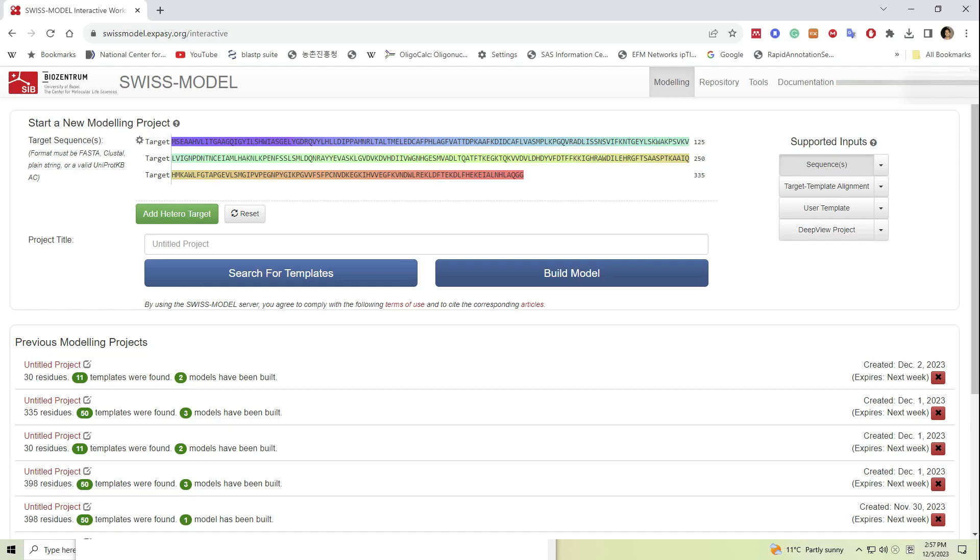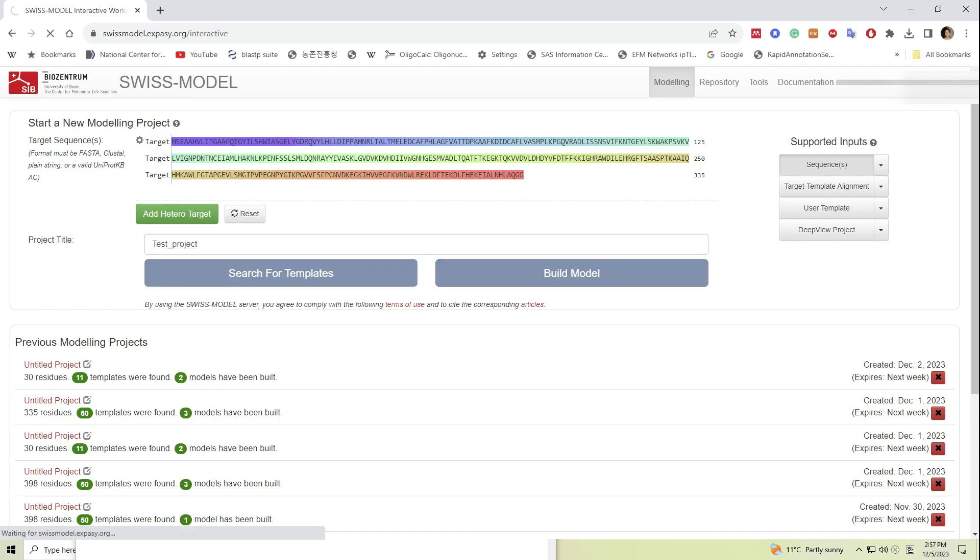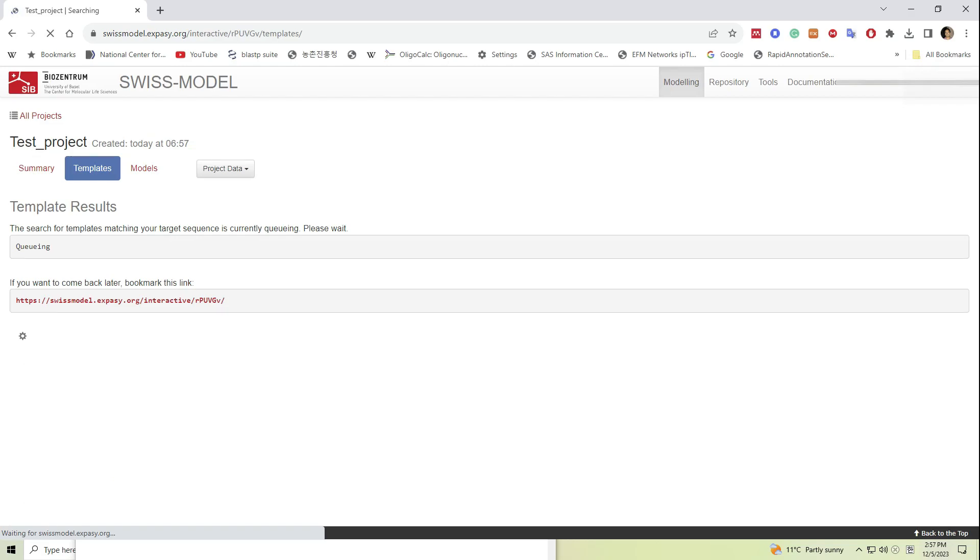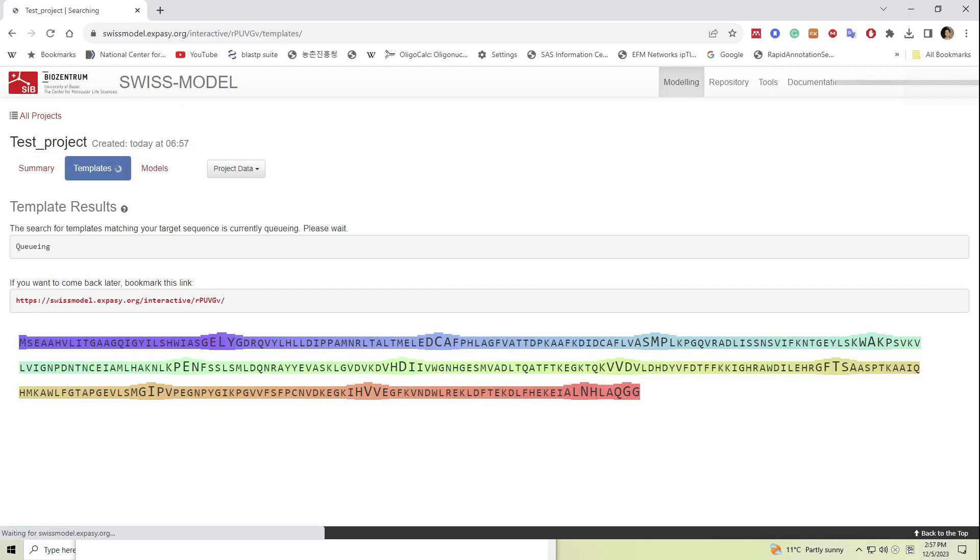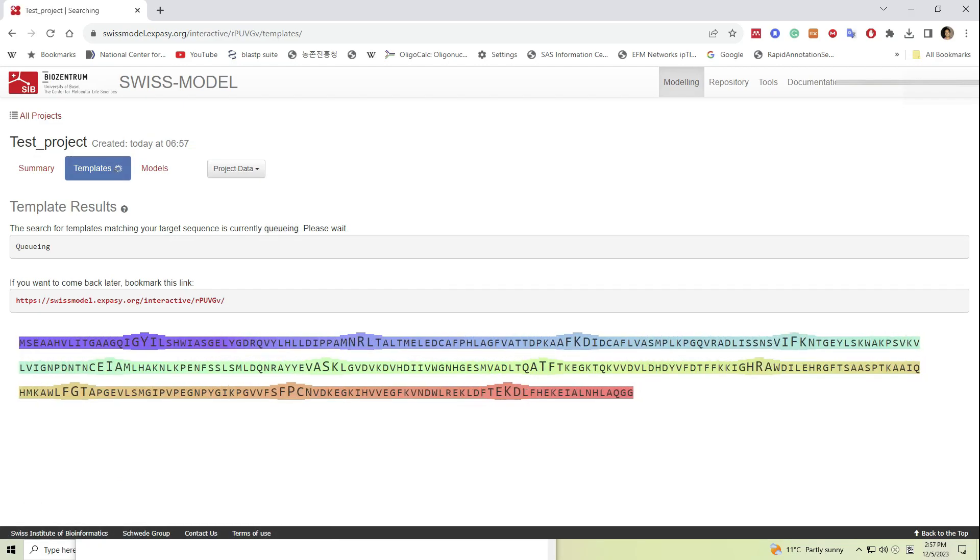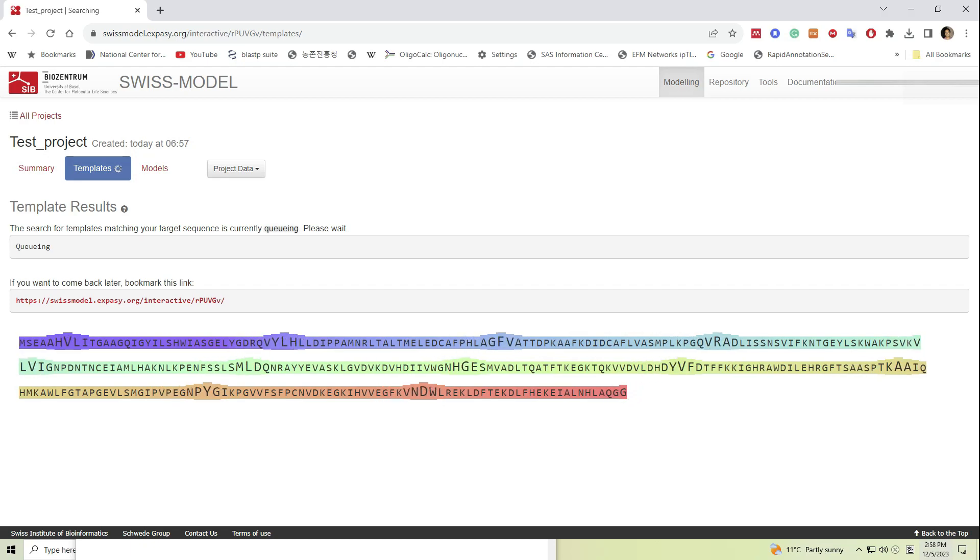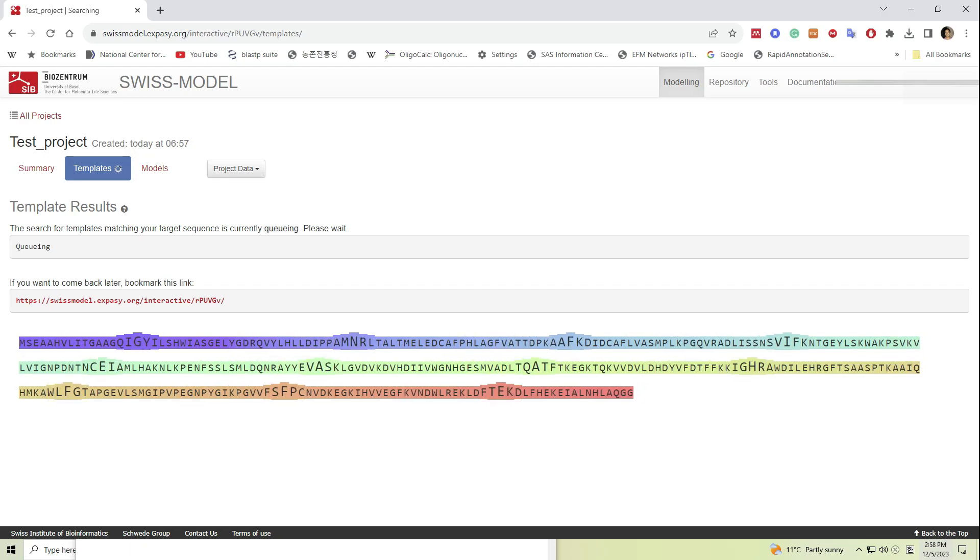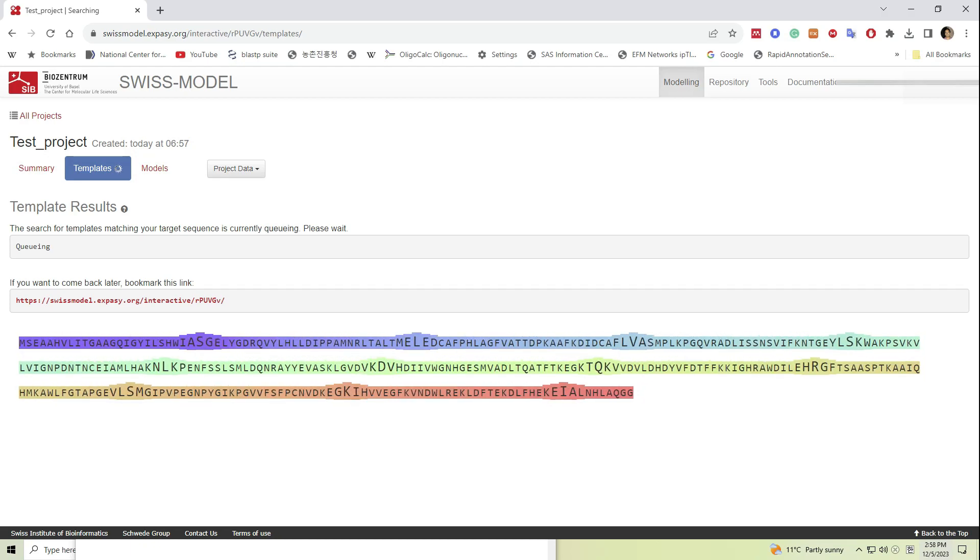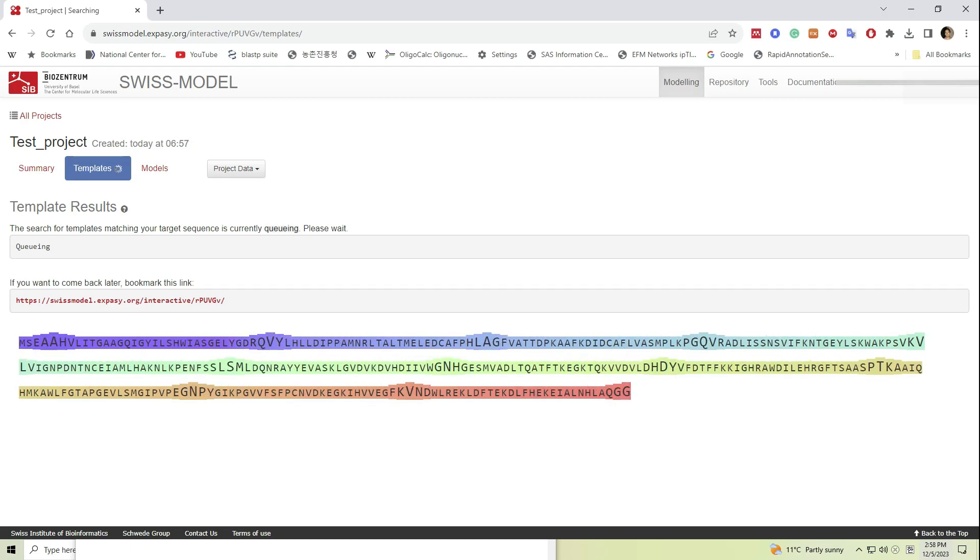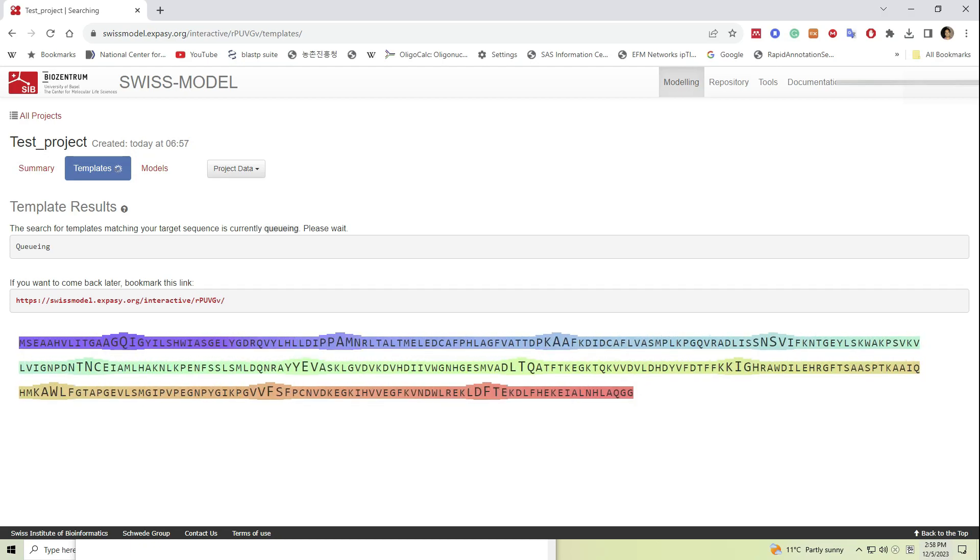To insert the input file here, we can choose upload option or just paste the sequence into the window. Click on the search for template button and wait until the software processes several templates that match with our query protein sequence. This process will take some time and what is going on can be seen in the window.